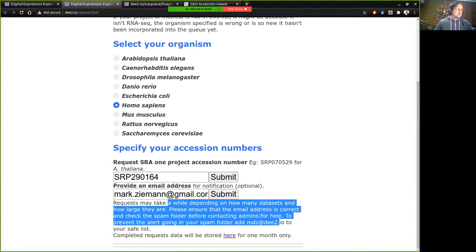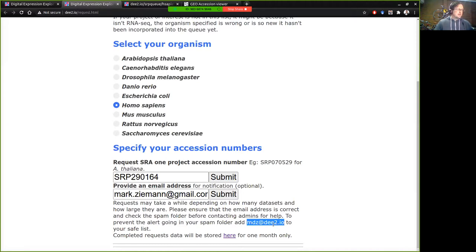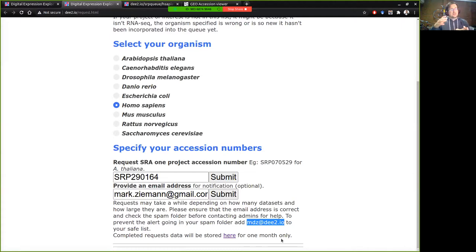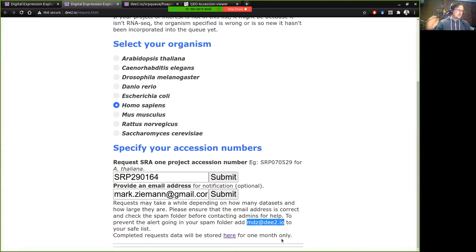Just to ensure that these notifications don't go to your spam folder, add this email address to your safe list and you might also want to check the spam. And we have a location here for where all the requested datasets will be stored temporarily until the main database is updated and catches up and incorporates all of those data from the express queue. So let's submit that.